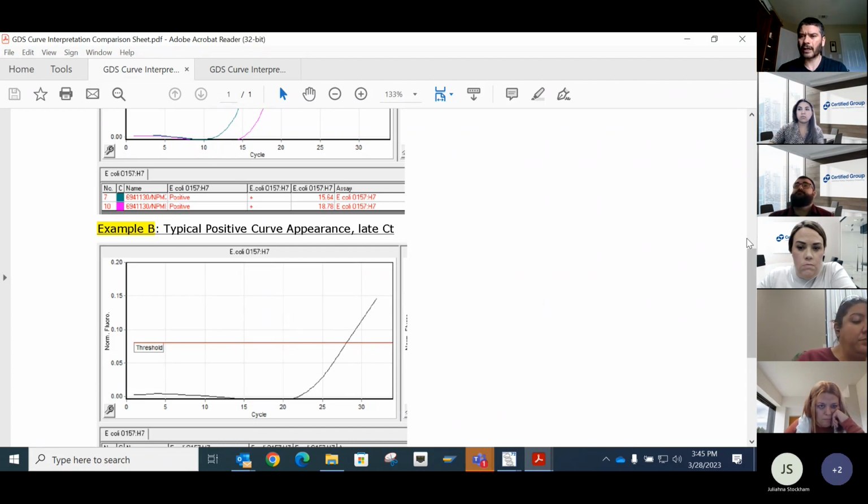I think it's in between 2 and 3 minutes. But if you watch it, it's real-time analysis, right? As the DNA amplification occurs, when the temperature drops and the DNA comes together, if it is the target sequence, the probe will attach. And when it does, at the next reading you see the jump in that line.